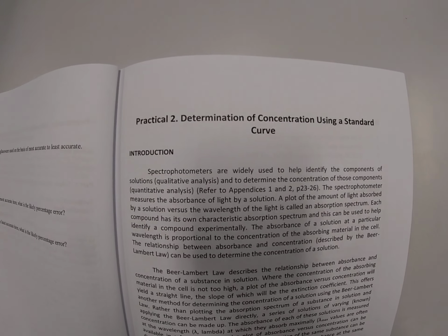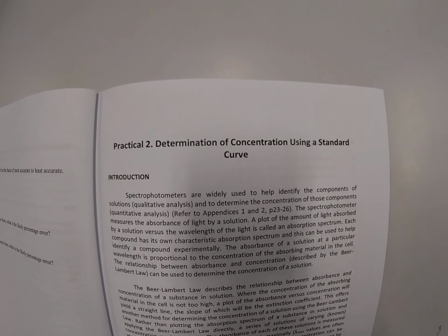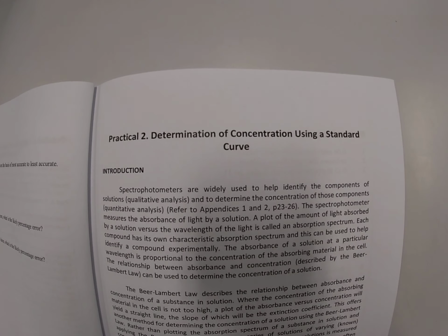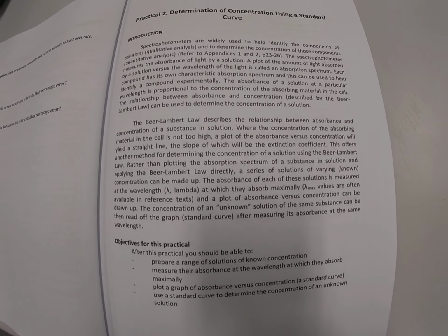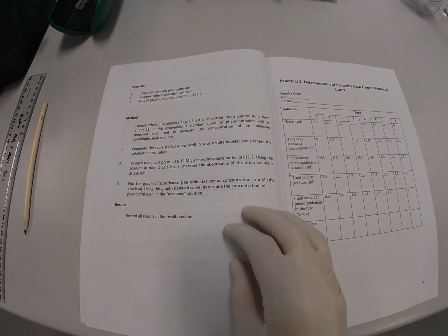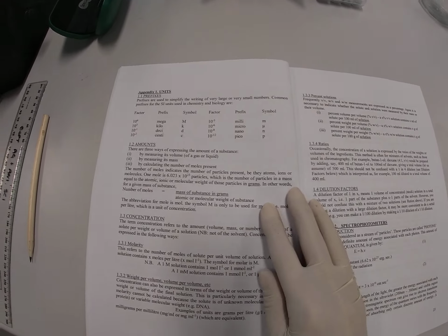We will be looking at Prac number 2, determination of concentration using a standard curve. So before you watch this video any further, make sure that you have read this Prac very carefully. Also make sure that you read the appendices.